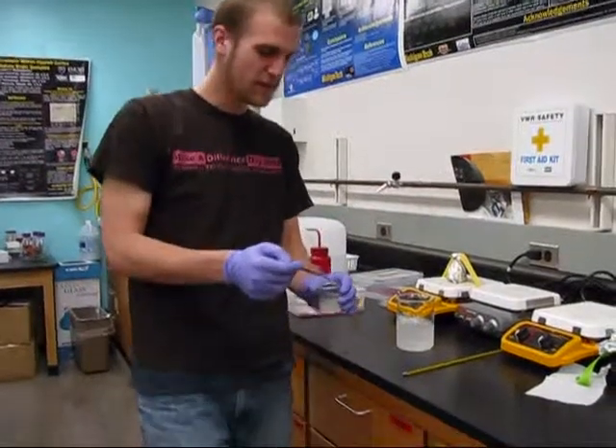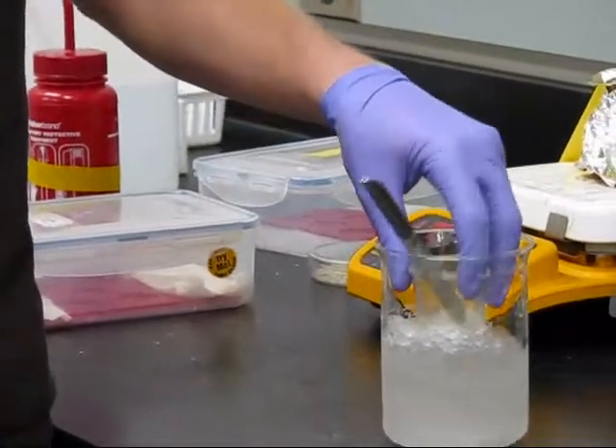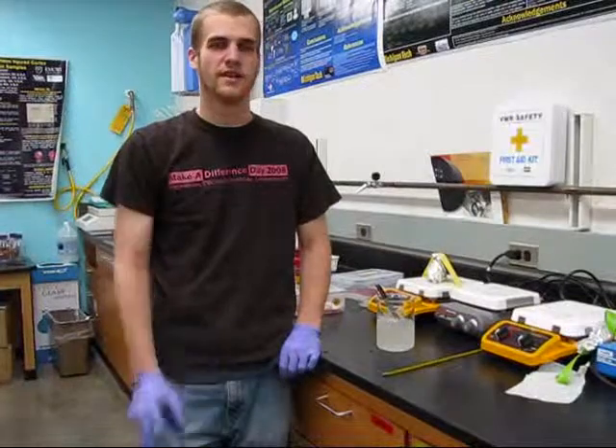Here is an example of our hydrogel. It's composed of agarose and methyl cellulose, and it forms a gel at physiological temperatures, or about 37 degrees Celsius. As you can see at room temperature right now, it kind of flows. One good thing about this hydrogel is that you can place it into a syringe and inject it into the body, and once it goes into the body, it'll form a gel and solidify.